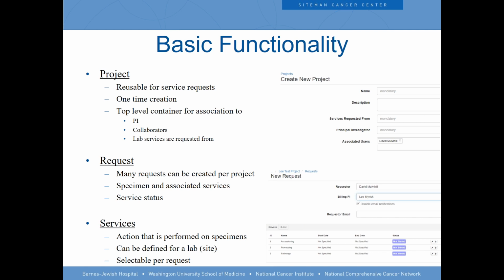Yeah, so that's one thing that I keep talking with the TPC about. And surprisingly, they are very happy with the way it is. I mean, for a first iteration, that is pretty amazing. And I think it has to do a lot with the forms, that we were able to build forms that they wanted to look and feel the way that they wanted them to. And that was, again, a big part of it.